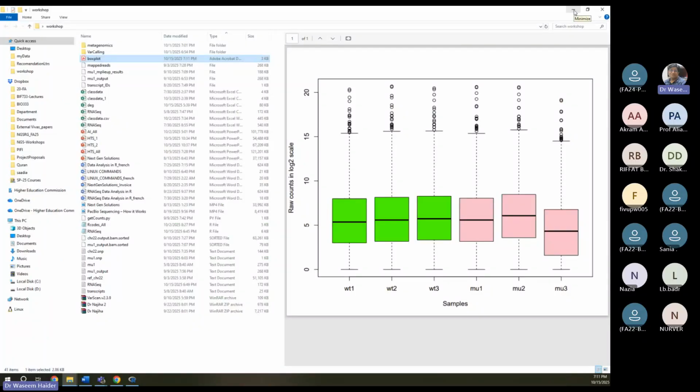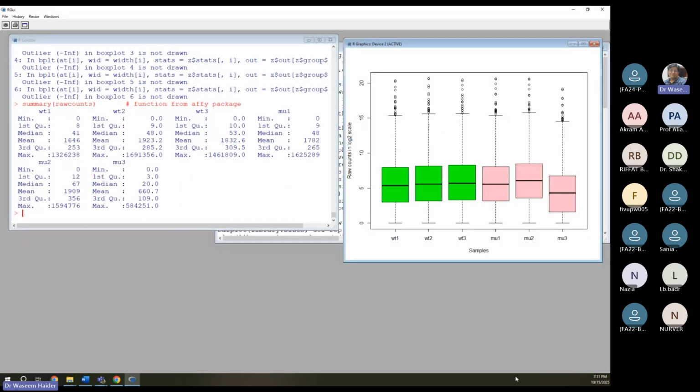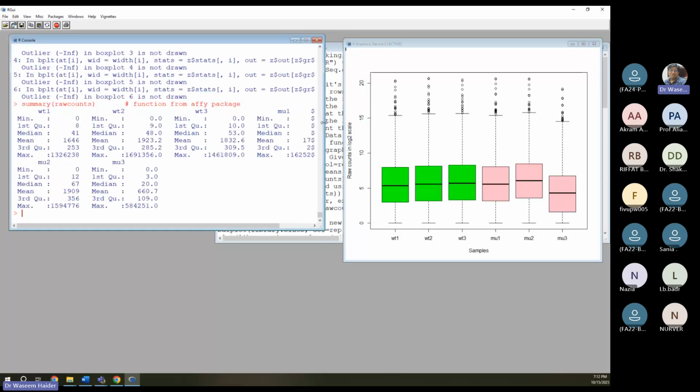Okay, talk about pictures. That paper should have proper everything. Nowadays they are quite hard on publishing. Okay, so you have to do a lot of things. Python, I believe, I think that their graphics is not, I mean, I did not like it. Maybe I'm an R guy. So the people in Python can comment on that.